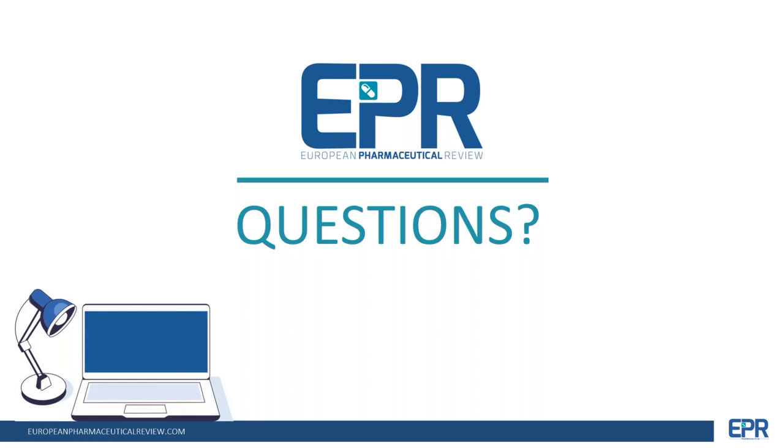Okay, so some more questions. Oligos are usually analyzed using negative mode ESI. Can you tell us, do you lose sensitivity when switching from negative to positive mode? What more can you tell us? So I can take that one. The short answer is no. We don't lose sensitivity by going from negative to positive mode. In general, you get more efficient ionization in positive mode on the mass spec. And as I mentioned in my presentation, the number of charge states observed in negative mode data is higher, and the peak intensity is distributed among those charge states. And as you saw from the data for the 20-mer, we get fewer charge states in positive mode data.